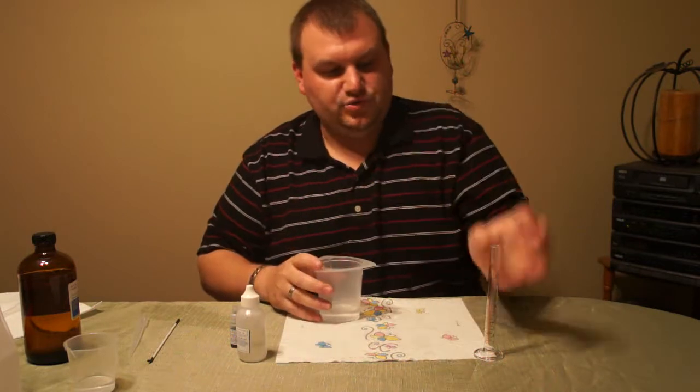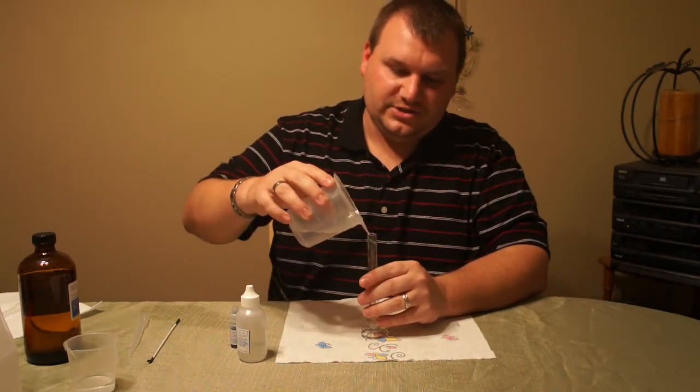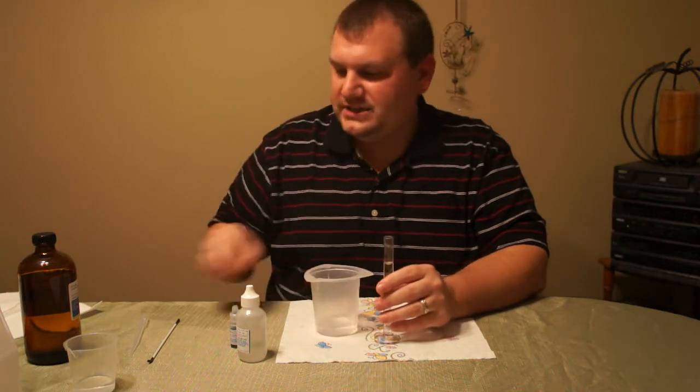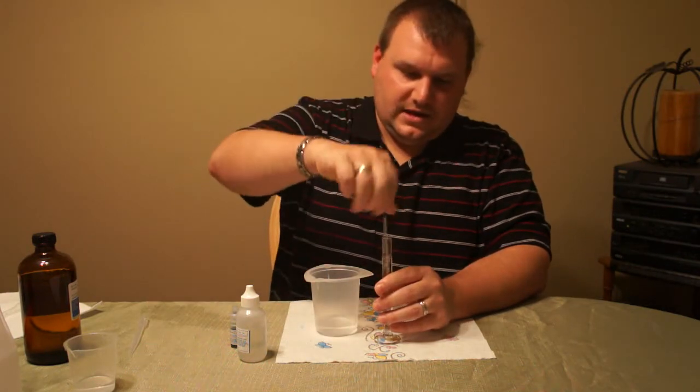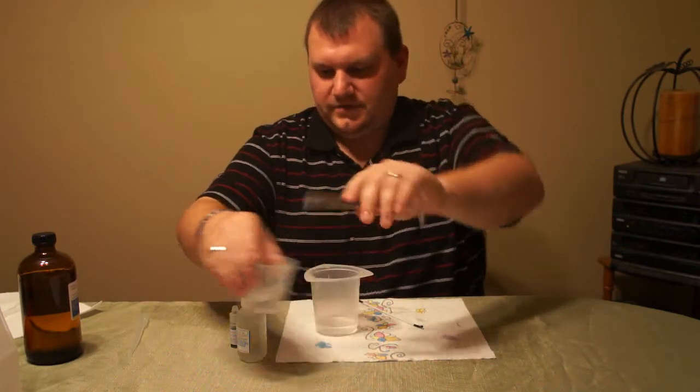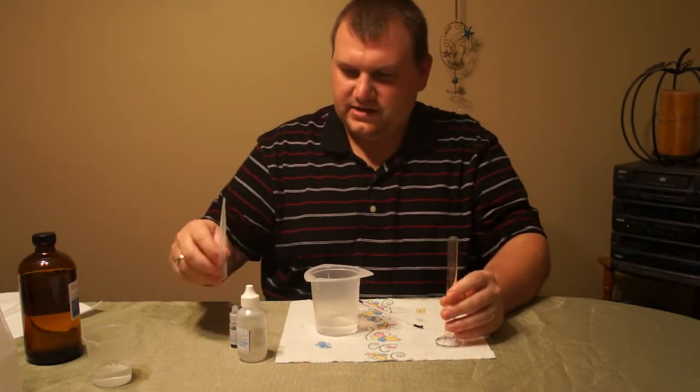So let's go ahead and get this test started. The first thing you want to do is rinse your testing supplies well with distilled water to make sure you get all contaminants out. I've already rinsed them a couple times — I'm just going to do a quick rinse here. If you have your pipette, you want to get that rinsed out as well.